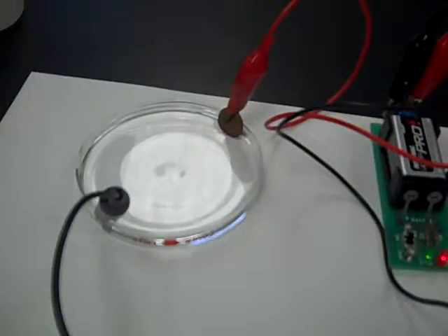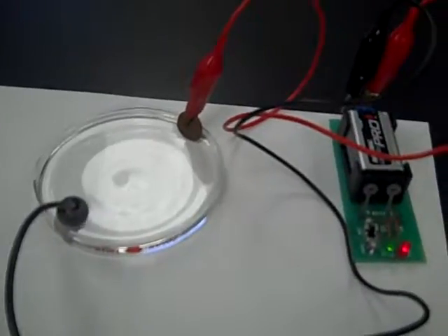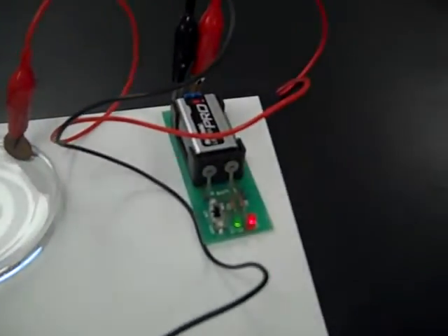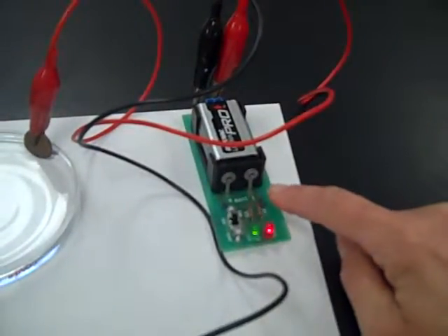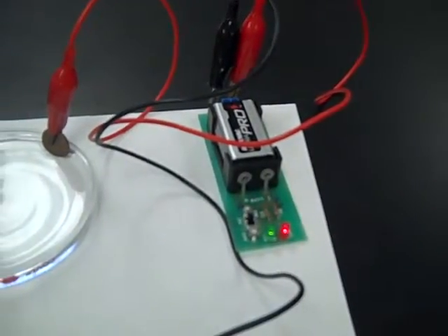Electroplating of copper penny with zinc. The copper penny is made a cathode. The red wire is for cathode and the cathode is connected to the minus sign on the power source battery.